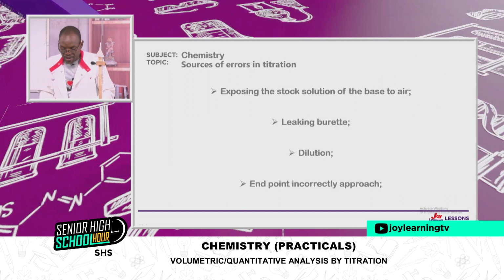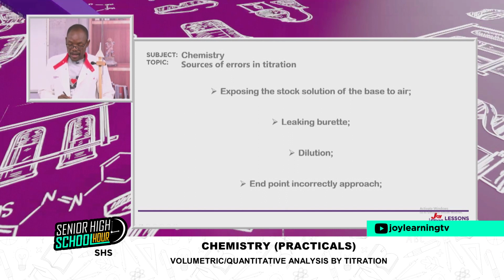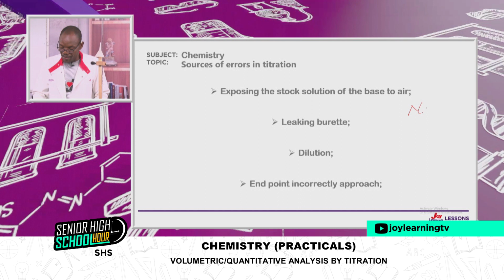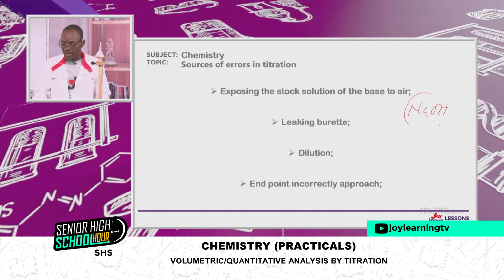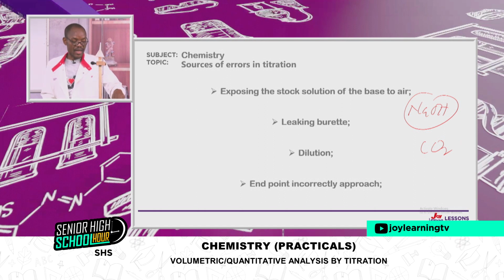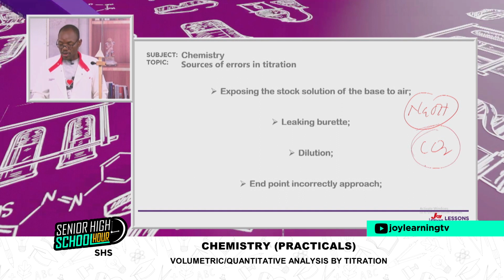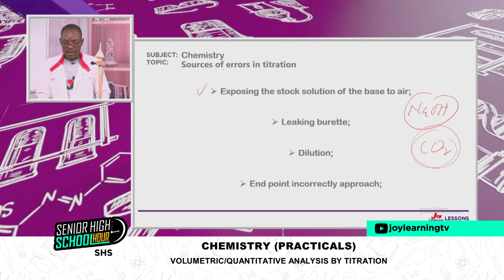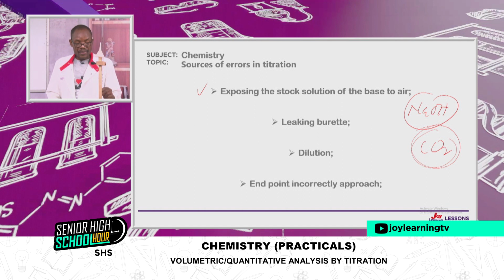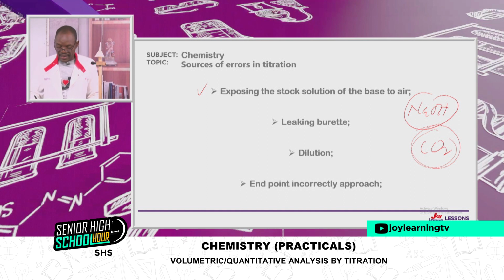The next one, exposing the stock solution of the base to air. If you prepare the solution, the most sensitive one is sodium hydroxide, because sodium hydroxide can absorb CO2 from the air. So if you prepare sodium hydroxide solution and you leave it in the open, it can absorb CO2. And this absorption can affect the original concentration, and that will have its effect on accuracy.